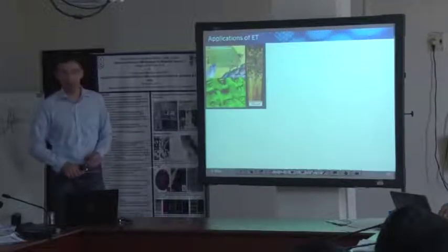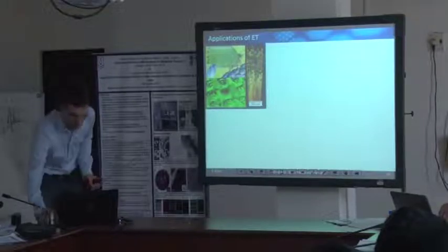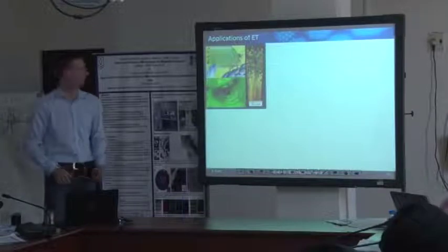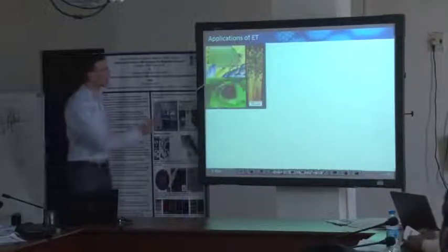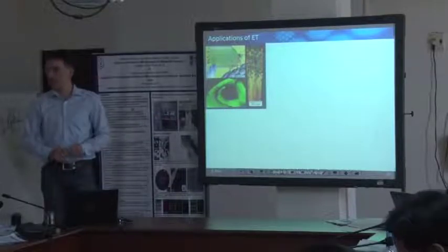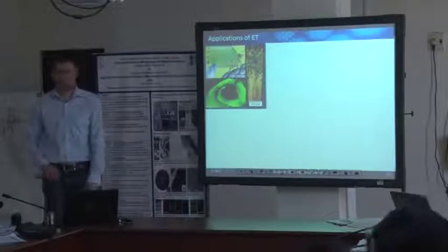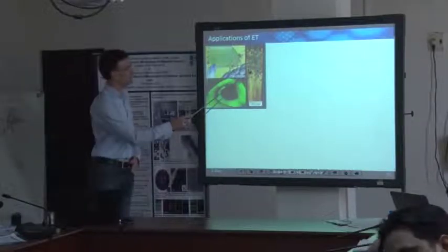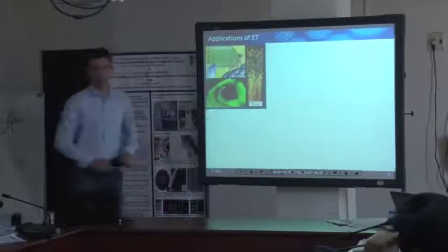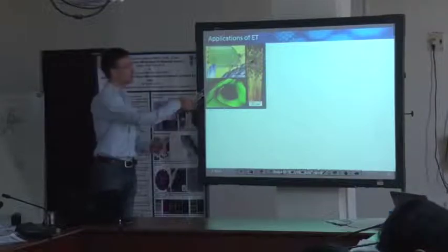So let's come to the data acquisition. First of all, I would like to show you a few examples of electron tomography, so that we have an idea what you can use it for. This is an example of photonic crystal structures in butterfly wing scales. People are interested in photonics nowadays. They want to generate artificial photonic crystals. And this was a project where we investigated individual crystallites on the micrometer and nanometer scale, how the chitin is distributed within those wings.